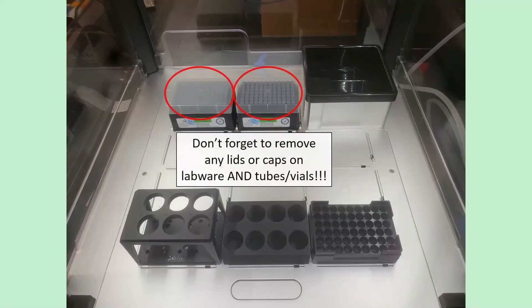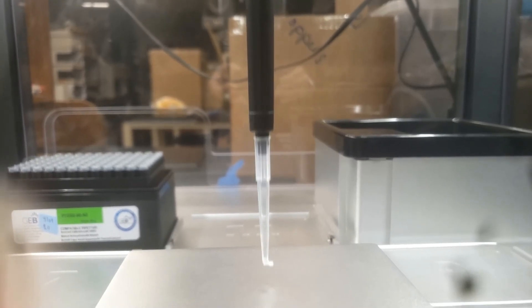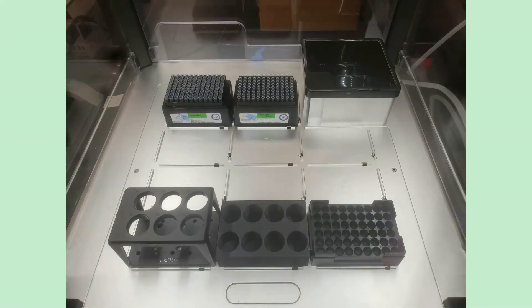You must remove any lids or caps from labware, tubes, or vials before running the robot. There are no sensors on the pipettes to detect collisions, so the robot will drive straight through a lid, shattering or bending the pipette tip. Make absolutely sure everything is uncovered before you start. Once that's done, you're ready to start programming the robot.